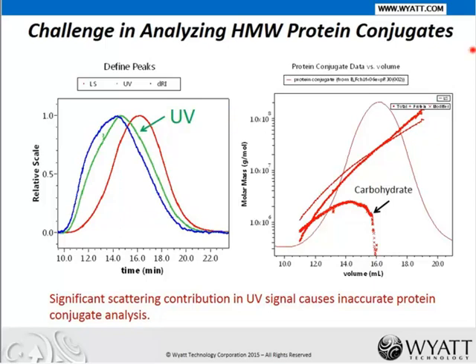When the molecular weight is over several million Dalton, the UV trace will often have an artifact that's actually from scattering. For an SEC separation, this will impact the left half of the peak, where the high molecular weight fraction elutes. For an FFF peak, usually it will affect the right half of the peak.